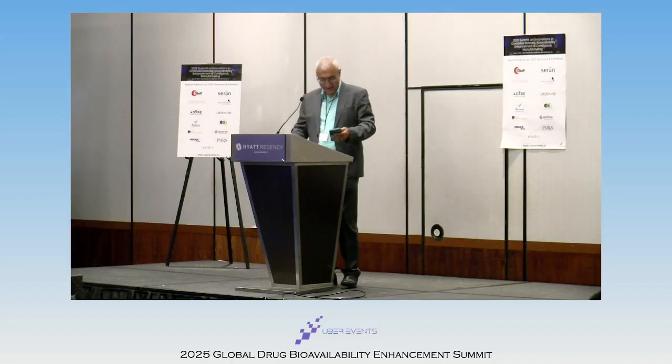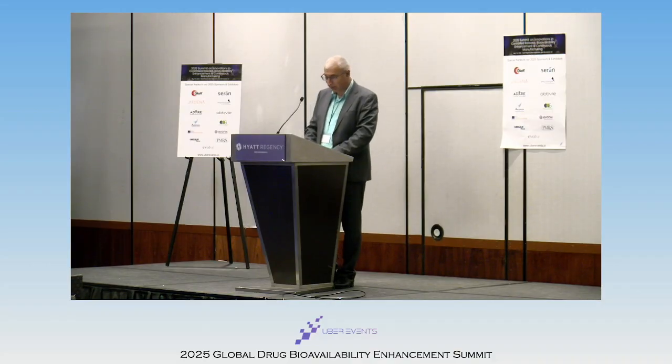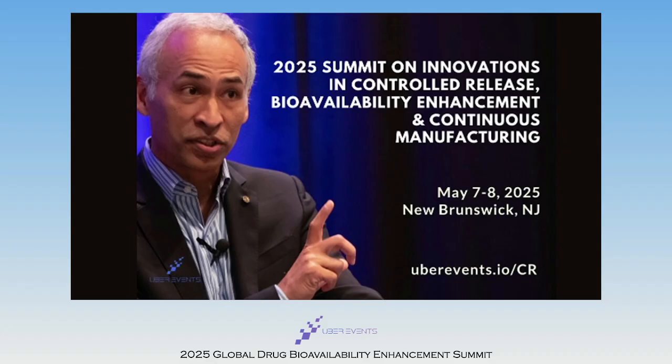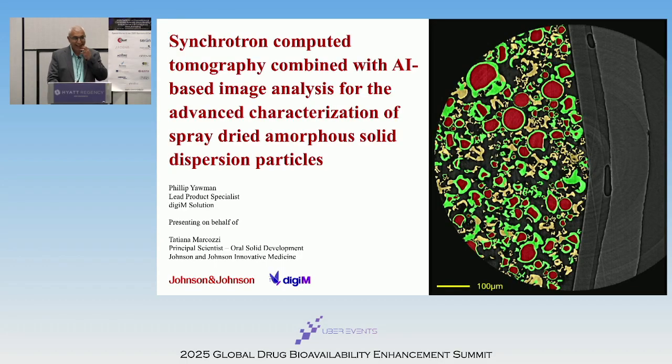Last but not least, it's our talk by Phil Yawman from DigiM Solutions. They actually are using magnets too, but not the same magnets, yes, for particle acceleration. So Synchrotron and Tomography combined with AI-based image analysis is a non-destructive characterization that allows us to characterize amorphous solid dispersions. So that's what Phil is going to talk about specifically.